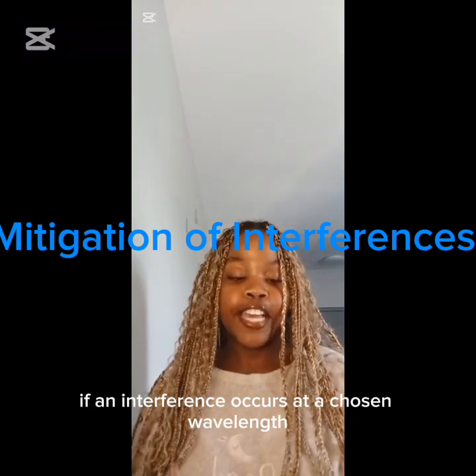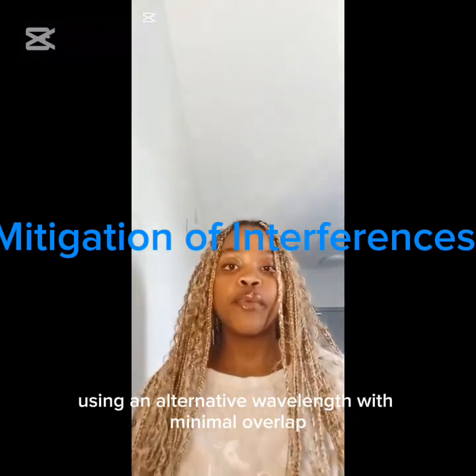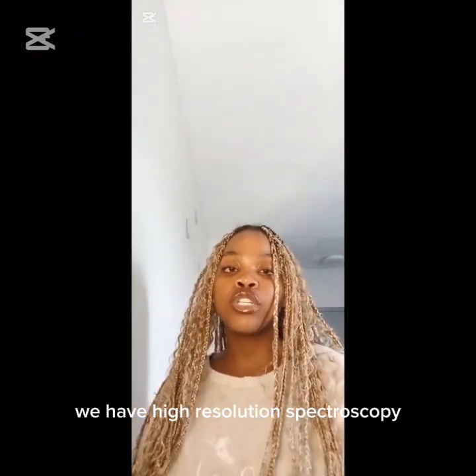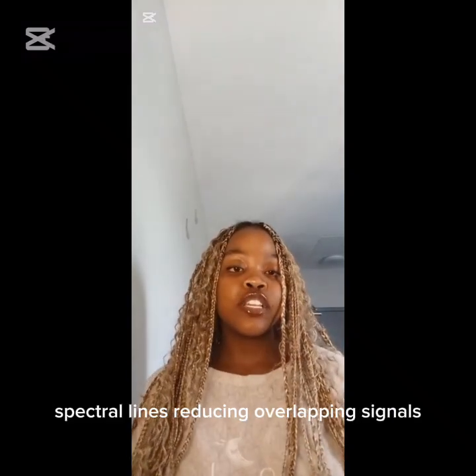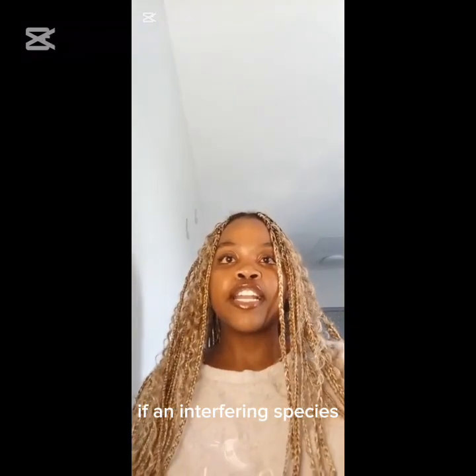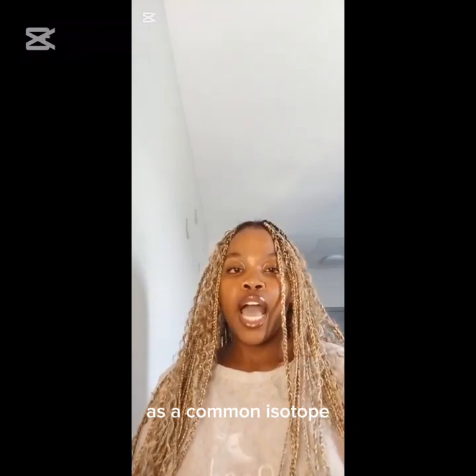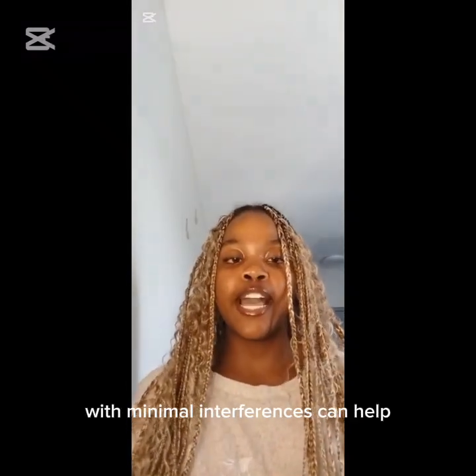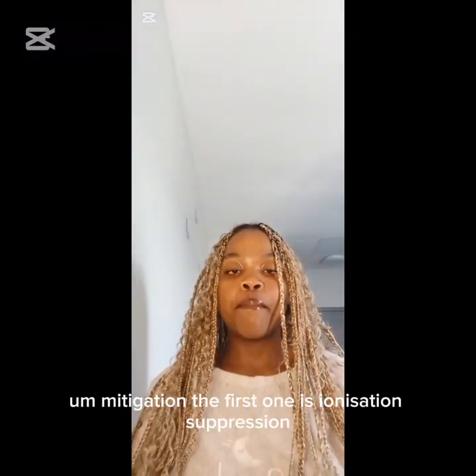For example, if an interference occurs at a chosen wavelength, using an alternative wavelength with minimal overlap can improve accuracy. Second, we have high resolution spectroscopy, which can distinguish close-spaced spectral lines, reducing overlapping signals. And now we have isotope selection. If an interfering species absorbs at the same wavelength as a common isotope, choosing a less abundant isotope with minimal interferences can help.